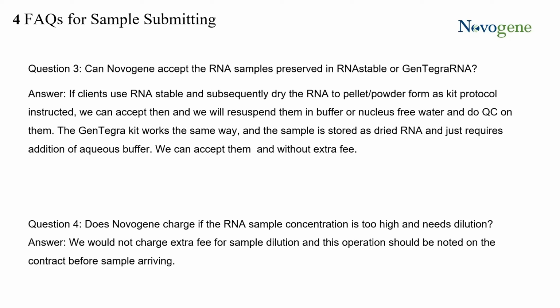Does Novogene charge if the RNA sample concentration is too high and needs dilution? Yes, we accept high concentration. We do not charge extra if we need to dilute them, but we would like to communicate about this before sample arrival. So with this, I would like to conclude my presentation here. I'm sure you will have more questions, and we are happy to help you. I'm handing over this presentation to the next speaker, Uma. Uma, this is for you. Thank you.